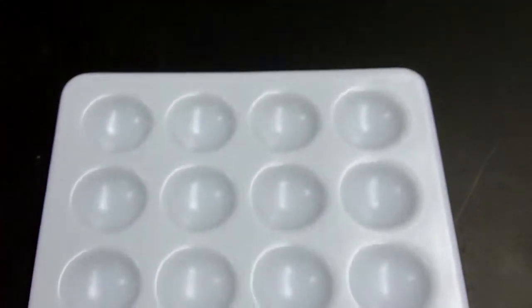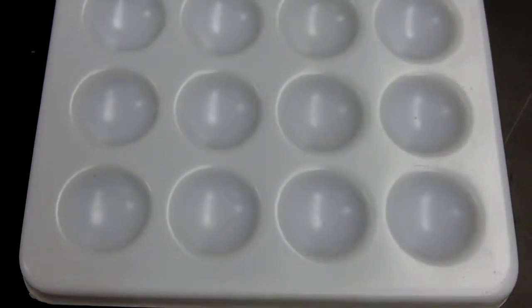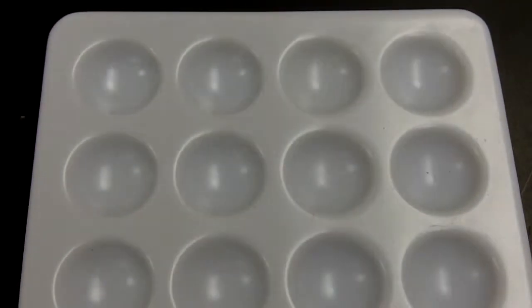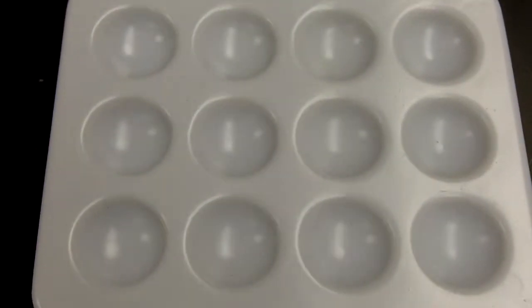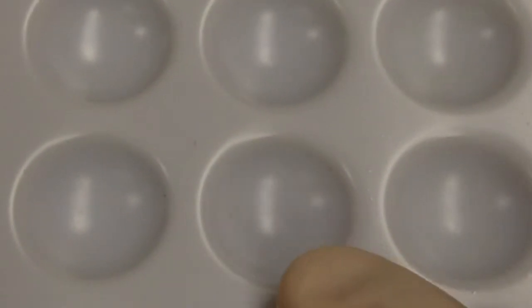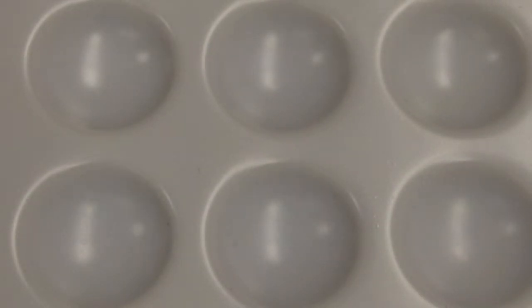Equilibrium A has us take a look at several stresses applied to the equilibrium equation given first. This piece of equipment is called a spot plate or a well plate, designed to get drops of various chemicals added to them for reaction purposes.